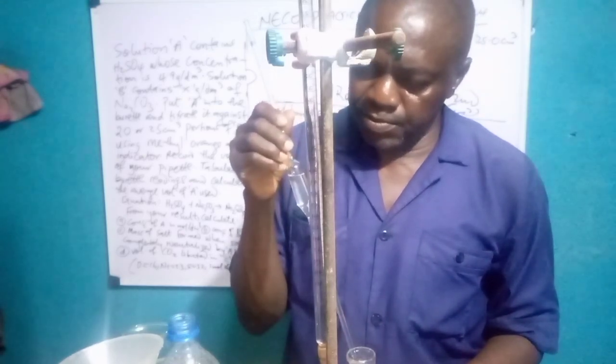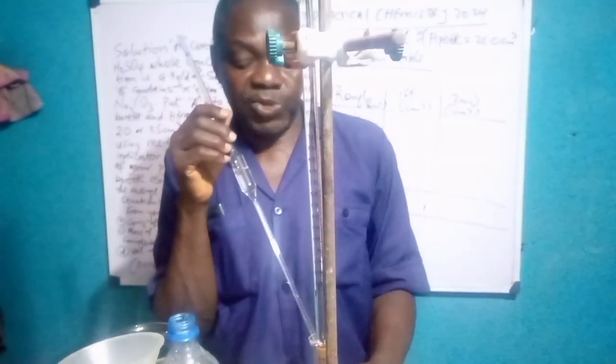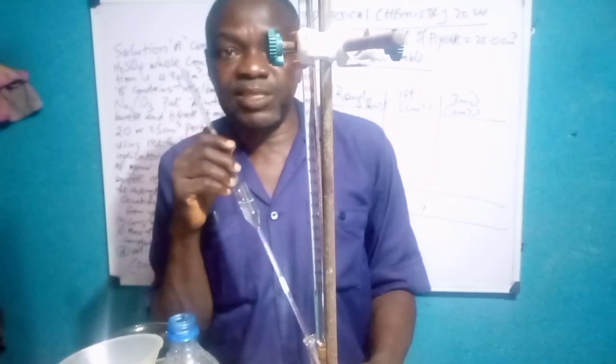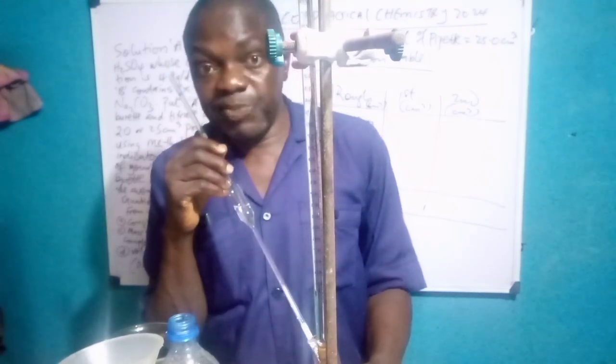I like to let it drain through on its own. Must not blow its air and be hasty. Nothing like that. In chemistry practical, we are very, very careful not to skip any step.